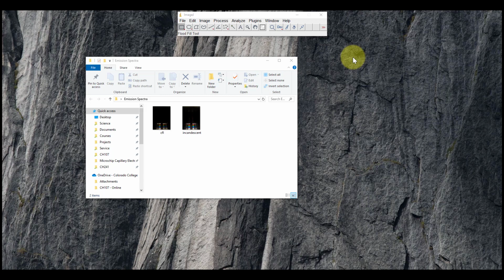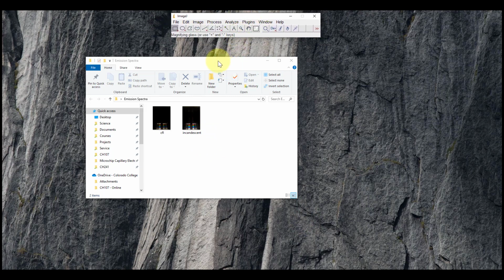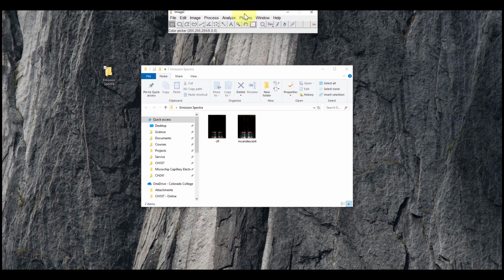So if you do anything with molecular biology, you do things in biochemical analysis, analytical chemistry, environmental chemistry, this is the tool that gets used more often than virtually any other image processing tool because it's free, it's robust, and it's simple. So go ahead and download it, drag it onto your desktop or what directory you want to install it in, and open it up. And what you're going to get is just this bar sitting here at the top. So there's not a large graphical user interface. You just have a taskbar and that's it.